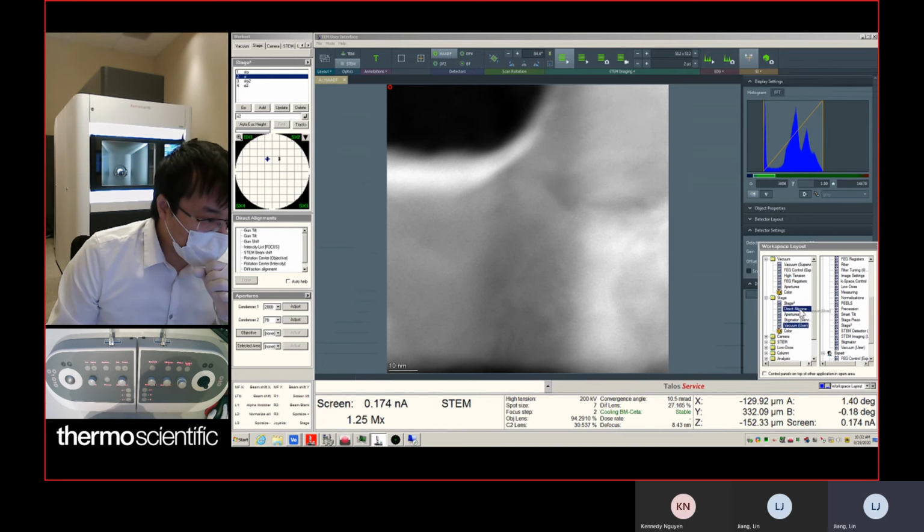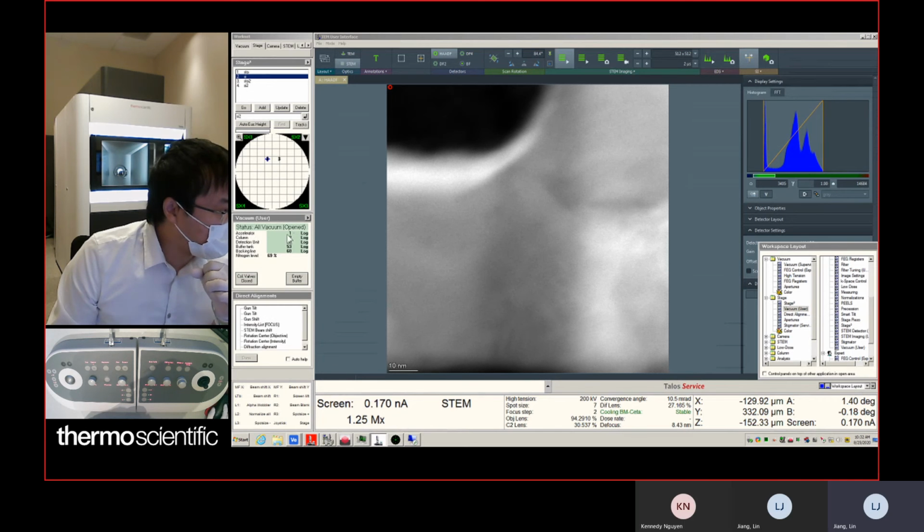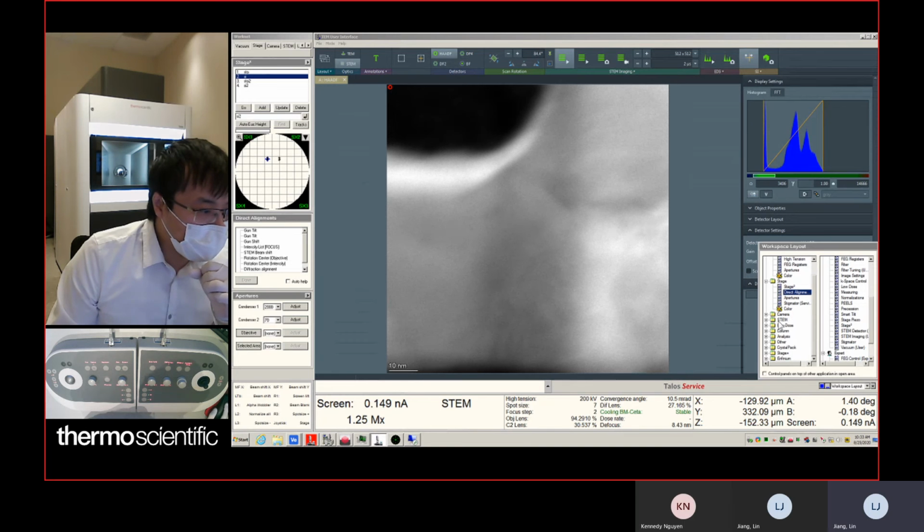So, move to the above. You see, this is your vacuum view here, right? Of course, I don't want to put a vacuum here. If you can jog to the right to remove it. Now you remove your vacuum view. Okay, so you can customize any type of window you want.